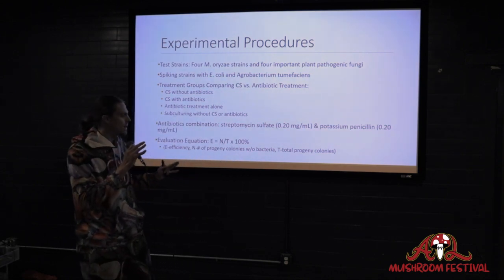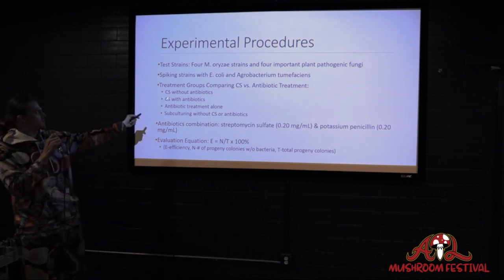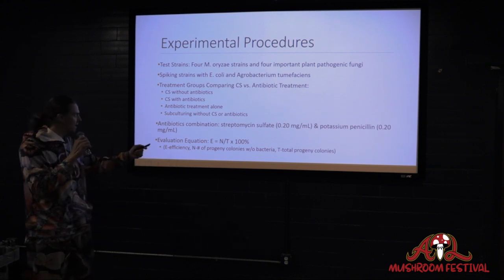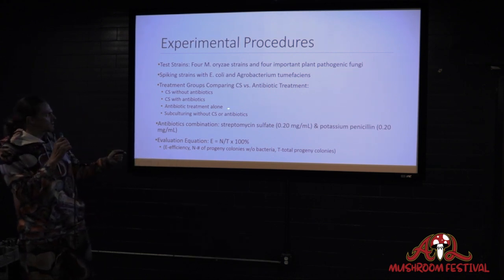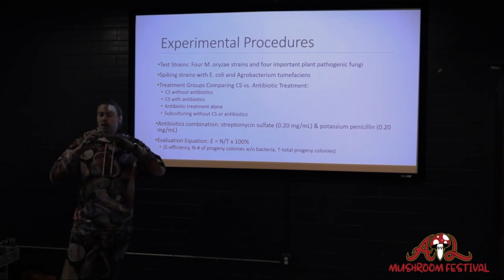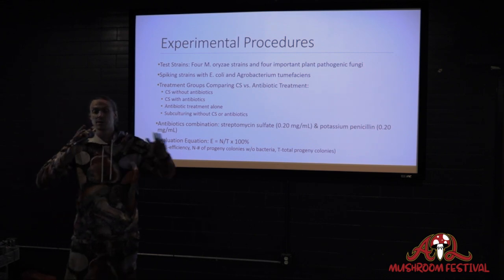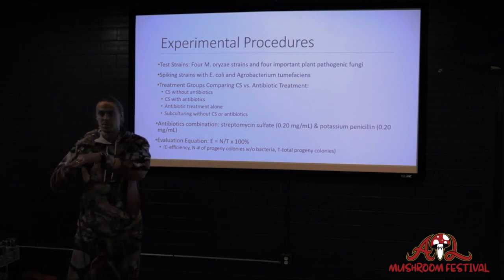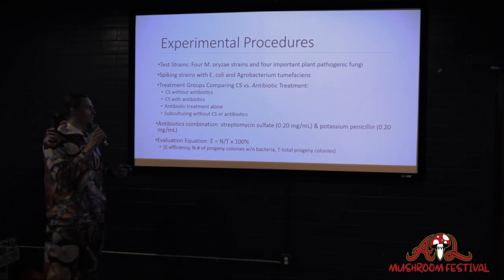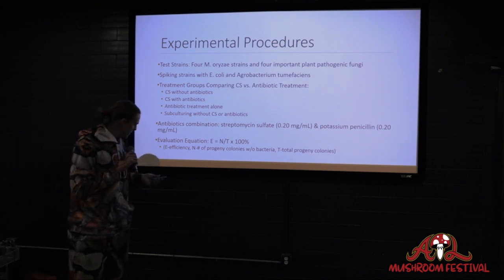Very, very common contaminant. And what they did is they did a treatment group of cabin sequestering without antibiotics, and then a group with antibiotics, and then a group with antibiotics alone, and then a group with subculturing, what I like to call optical isolation, running away from contamination, saying, well, that doesn't look contaminated, I'm going to put that to the next step. And the antibiotics used were streptomycin sulfate and potassium penicillin, which are used for most gram-negative bacteria.